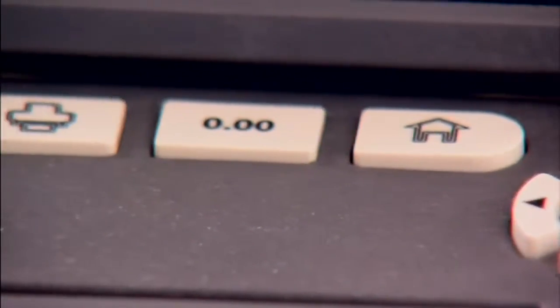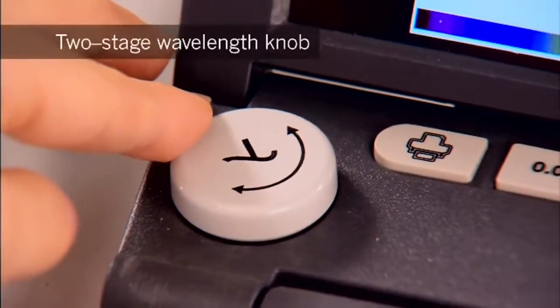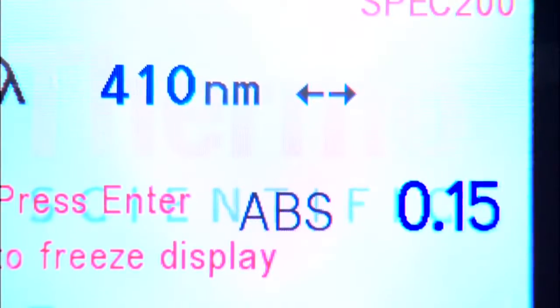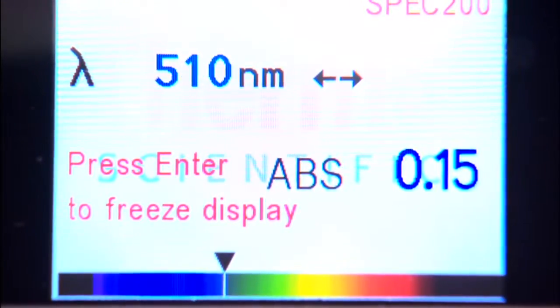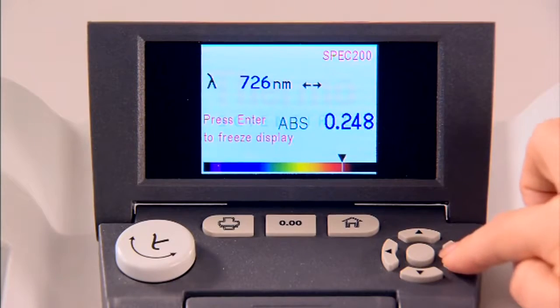The controls blend the modern and the familiar. The two-stage wavelength knob makes it particularly easy to set up the wavelength in an experiment. Modern live display mode shows wavelength and absorption, and the spectrum display helps students make the connection between numeric wavelength and the color of light absorbed. You can also adjust wavelength with the keypad controls.